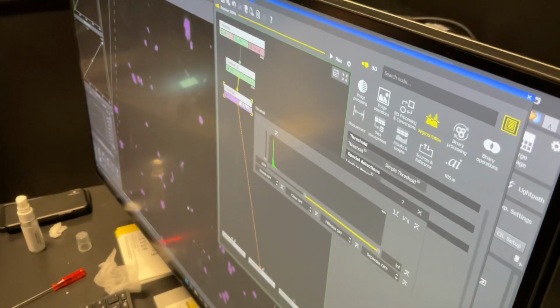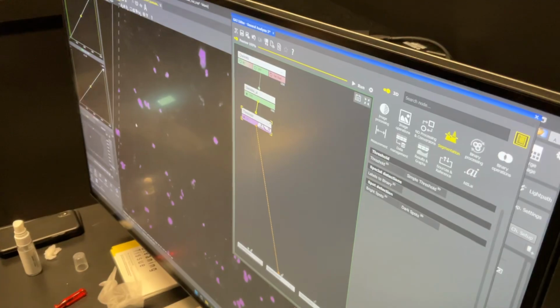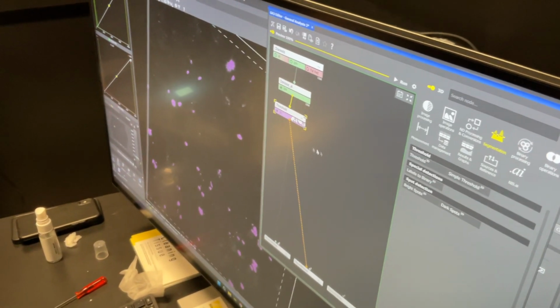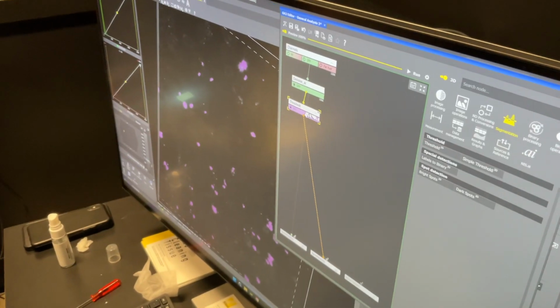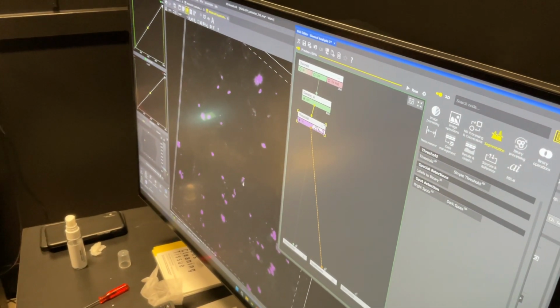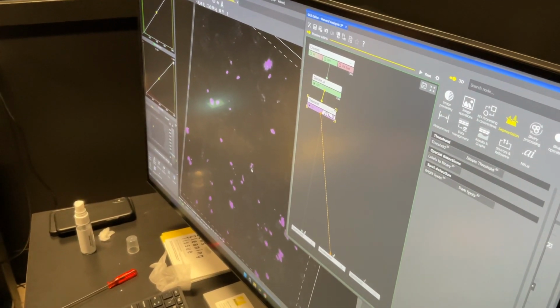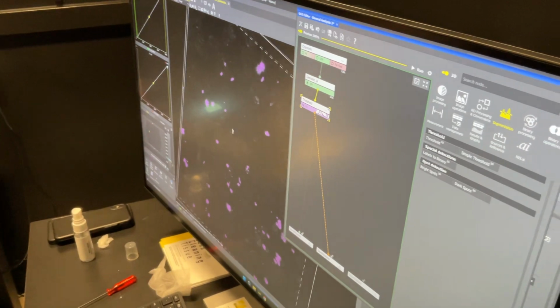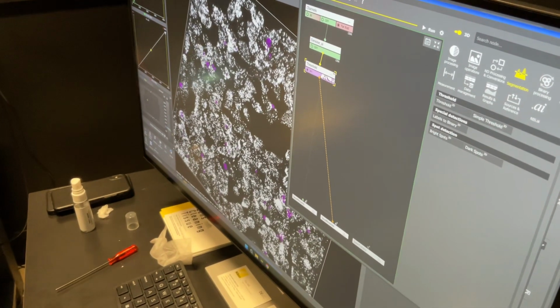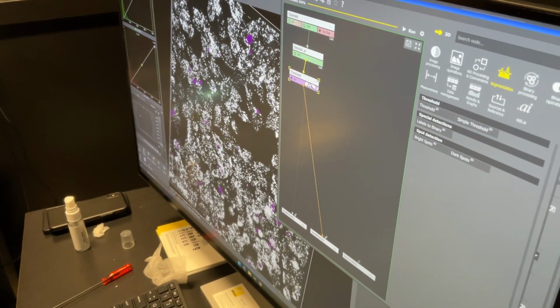We'll go this way. So again, maybe you throw in some filtering, maybe you don't. That would be the next step. Because sometimes getting the layer you want with this might be really hard if you're really trying to fine-tune it. So get the layer that's really dirty, and then clean it up afterwards. This is a bad image. This is just the one where I used a drug-resistant bacteria. Normally in this same image, there's probably only going to be like two really nice green spots. It's going to make it a lot easier.